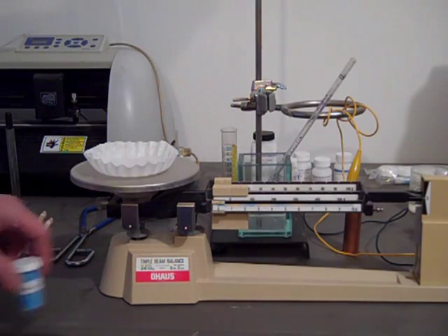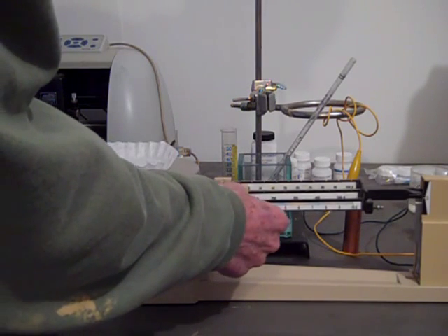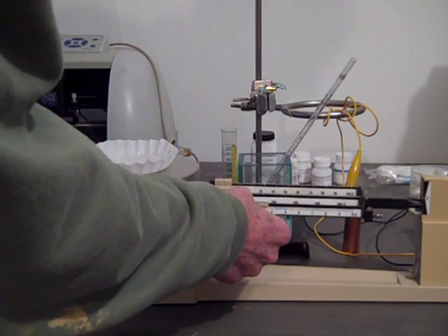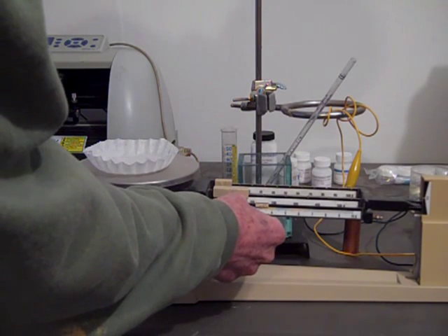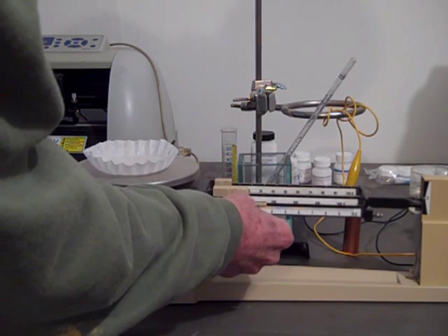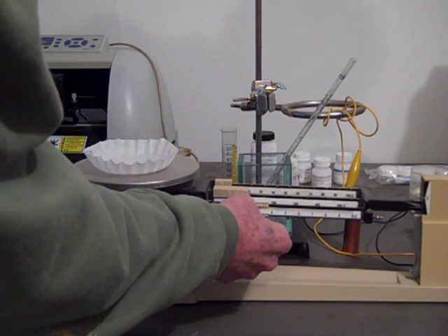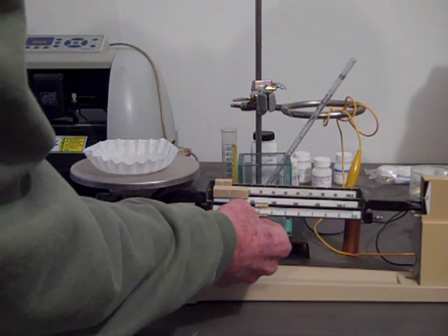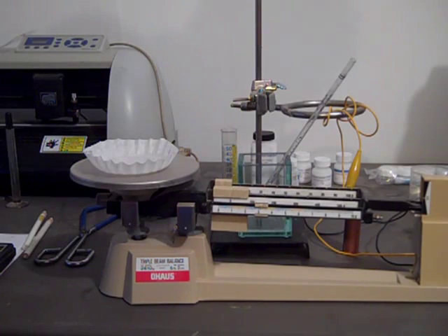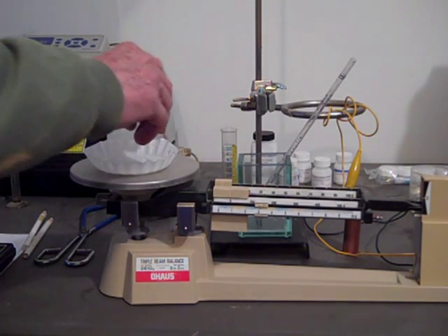The first thing we're going to do is weigh out 3.19 grams, just about 3.2 — 3.15, 3.2 — we'll just back off a little bit on that, and make our 0.2 molar solution, 100 milliliters of it.